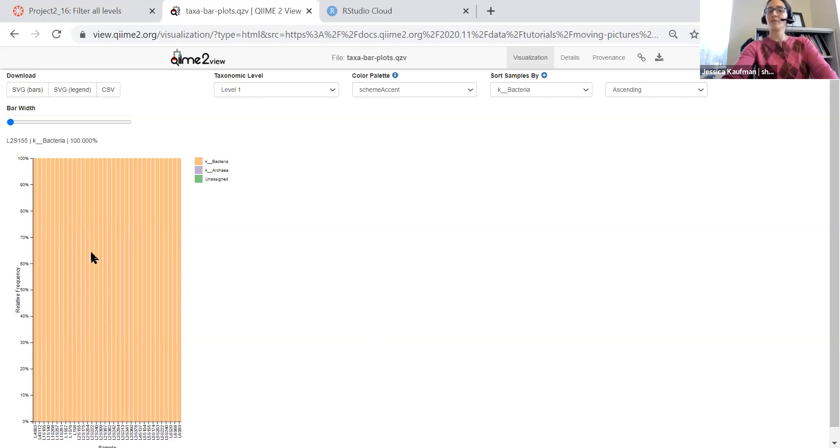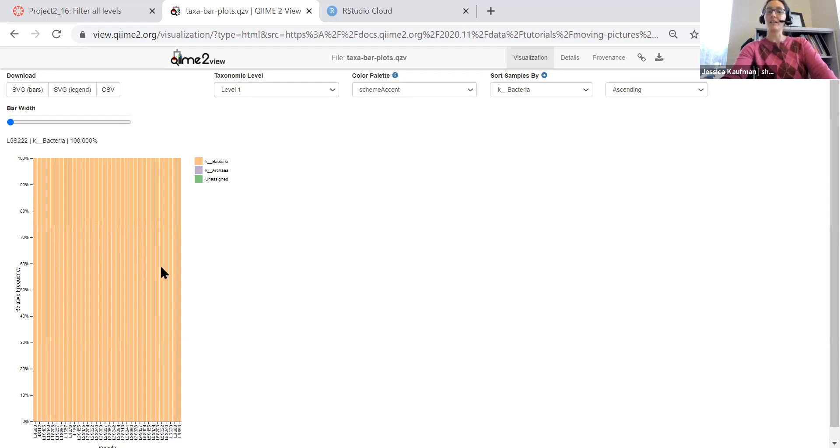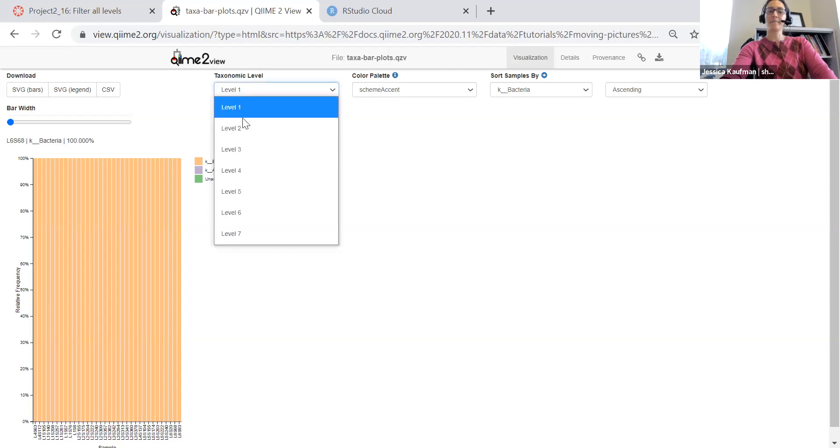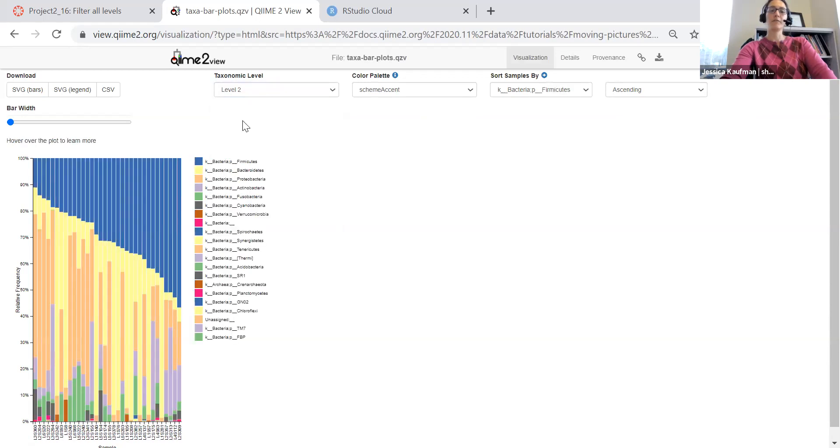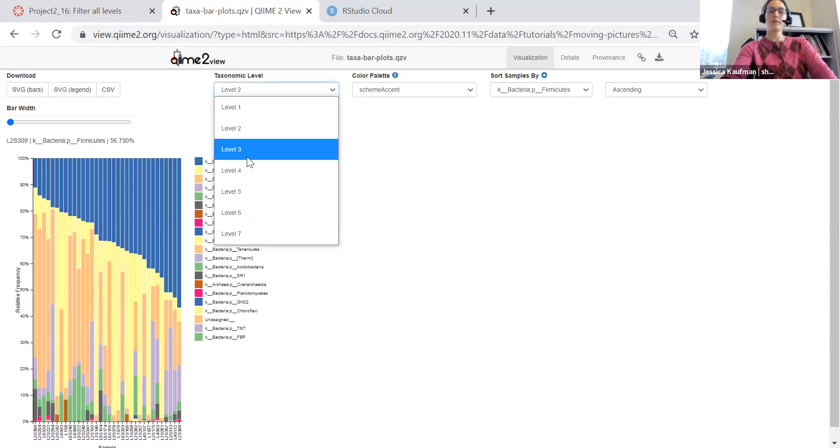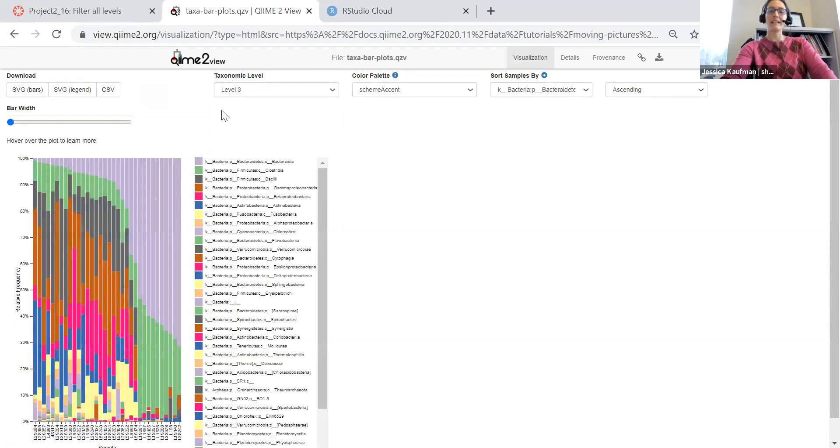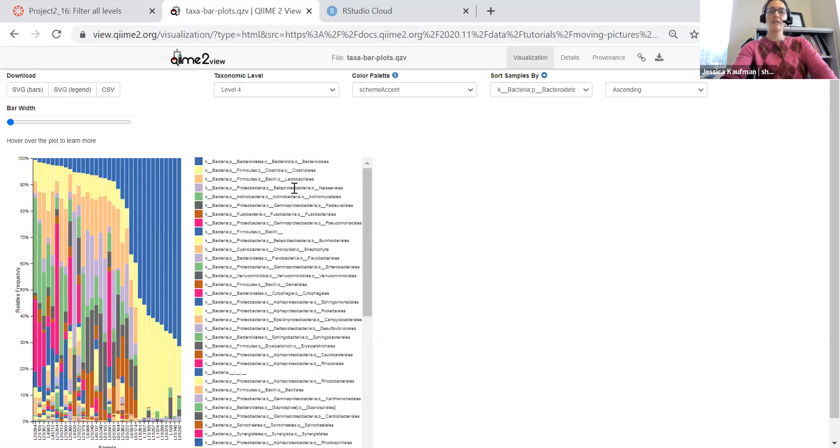So the first thing we see is level one. All of these samples, 100% of the reads map to the kingdom of bacteria. For level two, we see the phylum level. And we can keep going down in taxonomic level, look at class, look at order.